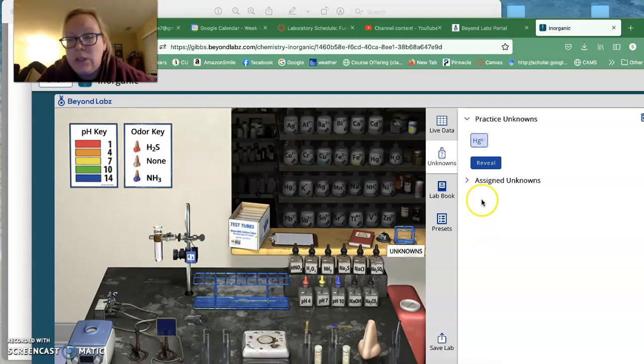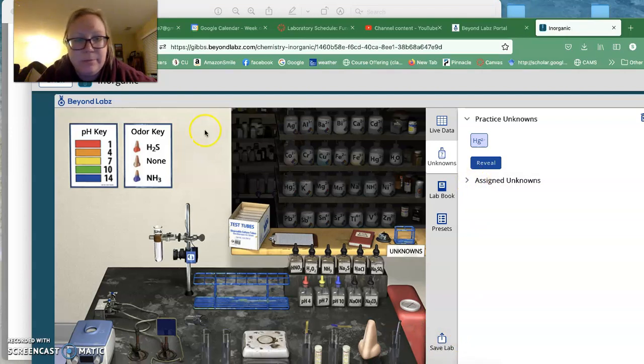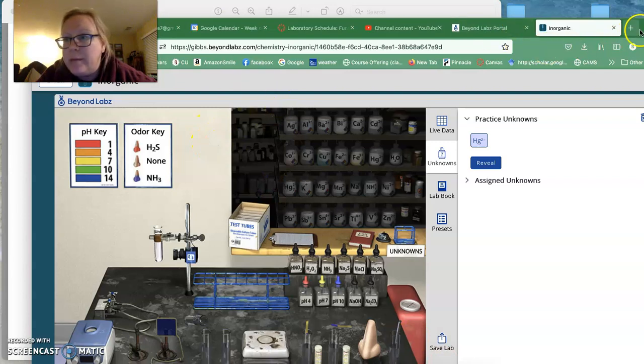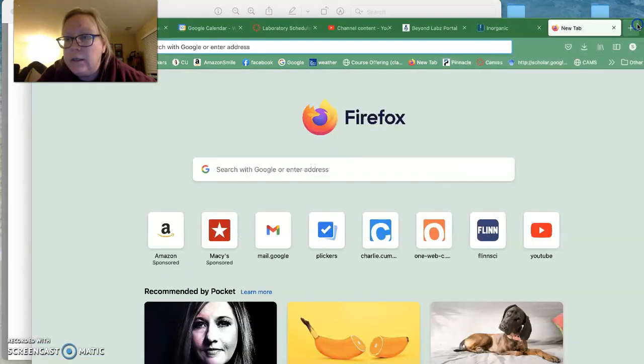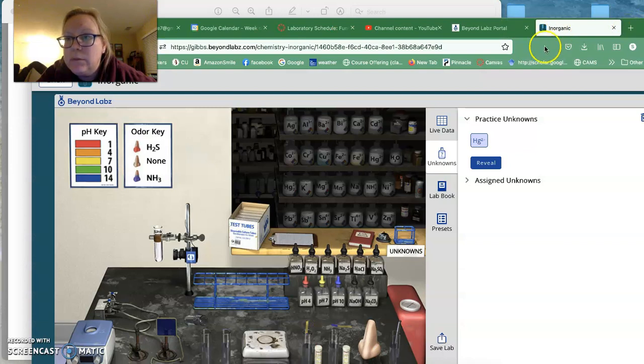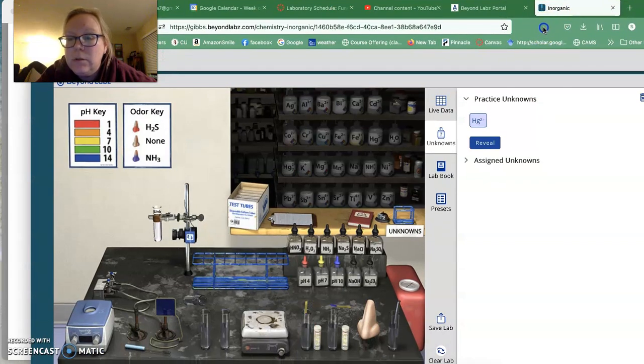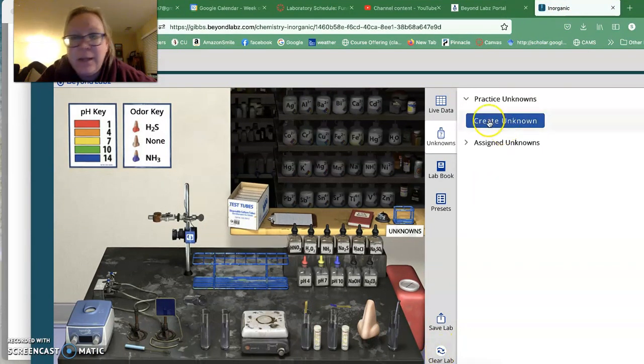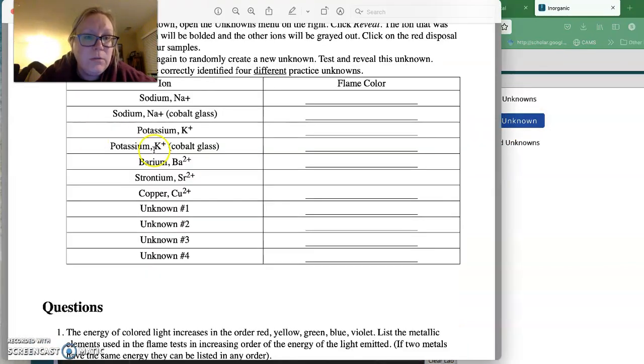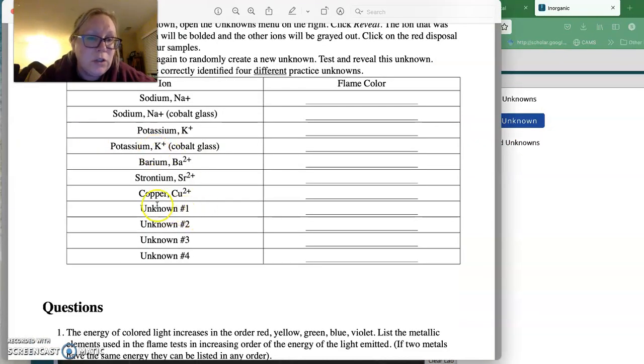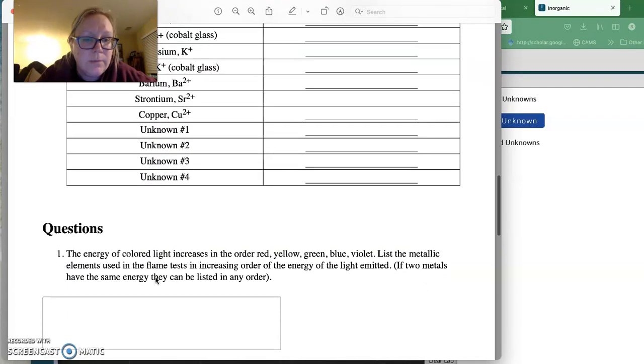And so then once you're done, you can come down here to this clear, there's a clear button. There's a clear lab button here and you can clear that and then create another unknown. And so I want you to, I'm going to let you choose. So you choose four different things that you would be interested in.